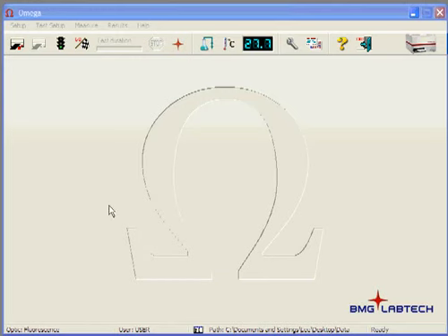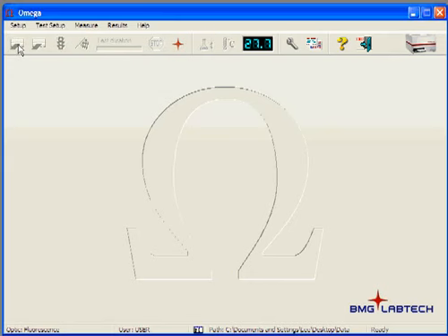Okay, this video will help you understand the basic icons at the top of the interface for the reader software and show you exactly what each one of them should look like when you open them. If we start from the left, this icon here is going to be the plate ejection button that allows us to eject a plate, and it will automatically come out and stay there.